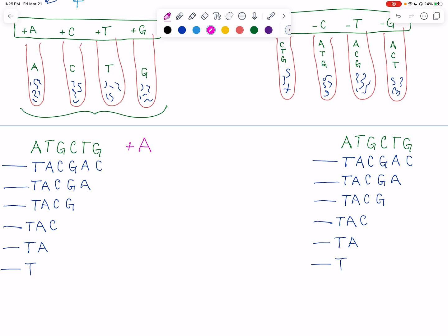So in the plus reactions, not only did they add nucleotides, but they also added an exonuclease. And we remember that exonucleases are going to be cutting down DNA from the end of a strand inwards. It just so happens that the exonuclease that they are adding is a 3' exonuclease, which means that it's going to chop away at the 3' end of the genetic material, which is right here. This is the 3' end, this is a 3' end, so on and so forth. So all of these sort of staggered ends. And so what is going to happen is that this exonuclease is going to come in and it is actually going to chew back some of the nucleotides.